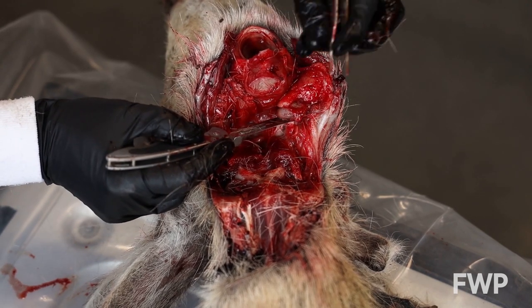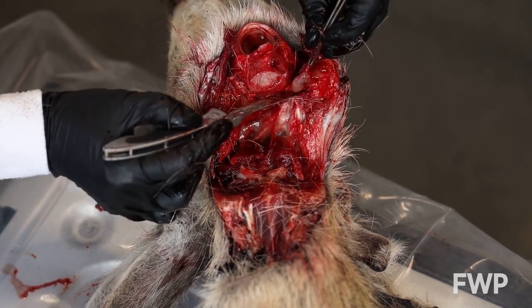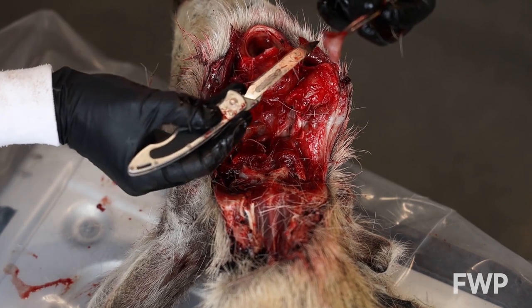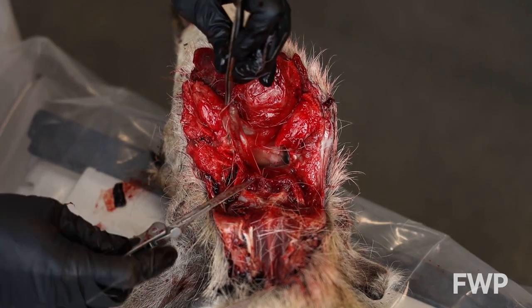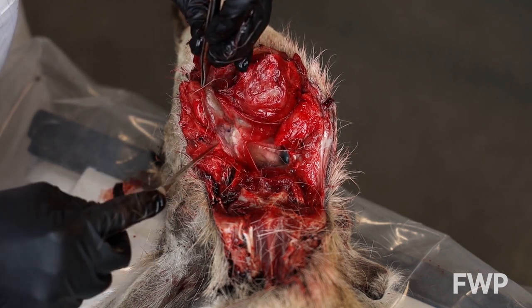CWD testing for moose also requires collecting the OBEX. Contact Montana Fish, Wildlife, and Parks for more information when collecting CWD samples from moose.